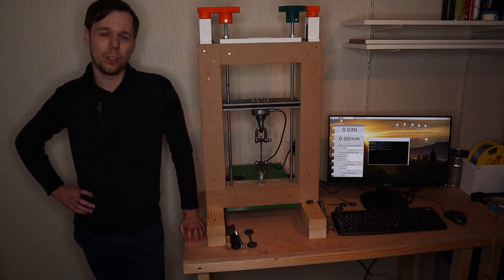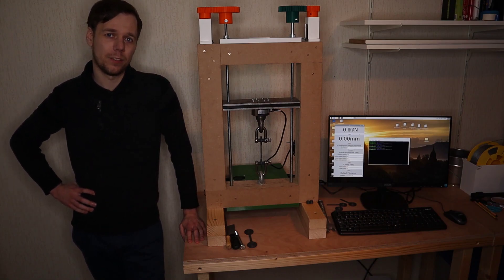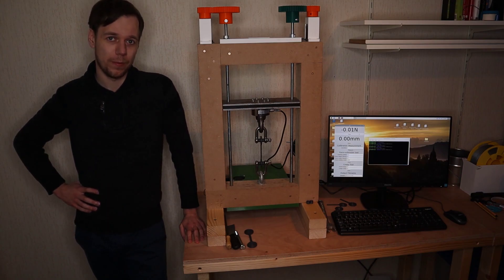Hi, about two weeks ago I finished work on this force extension machine, and since then I have been using it to investigate the phenomenon of creep in PLA.